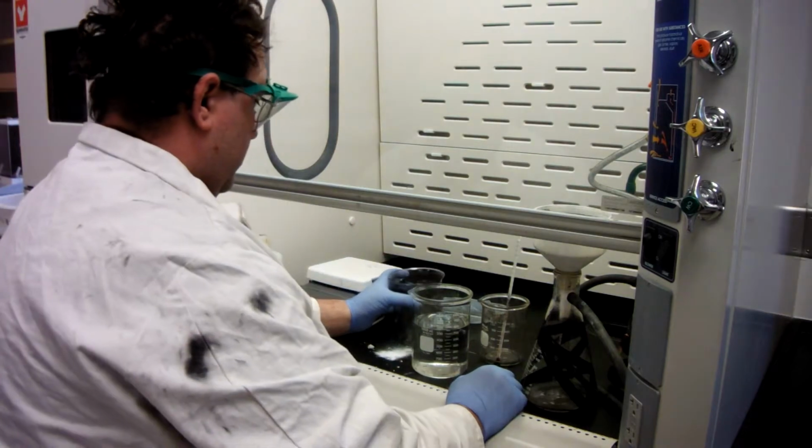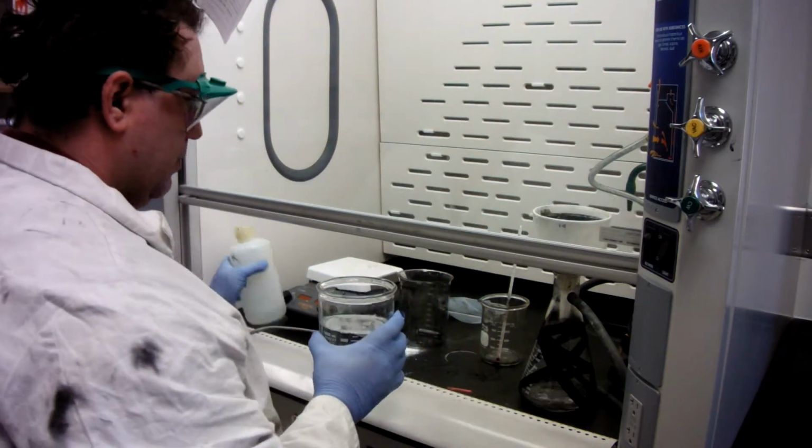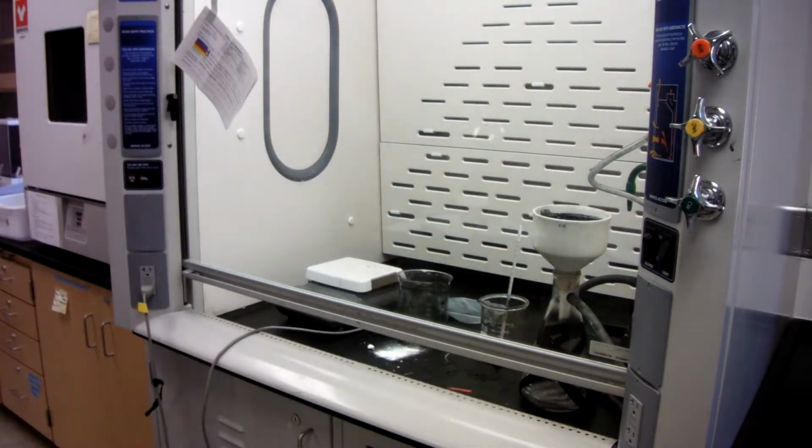We then take our waste out, and I'm also going to go get more DI water. I am off camera, but I am pouring the waste in the sink with lots of water flowing. Keep the water flowing and ensure proper dilution.